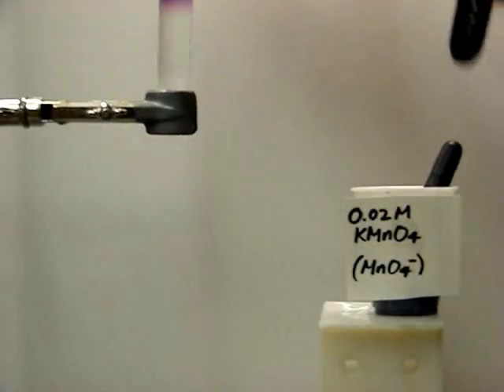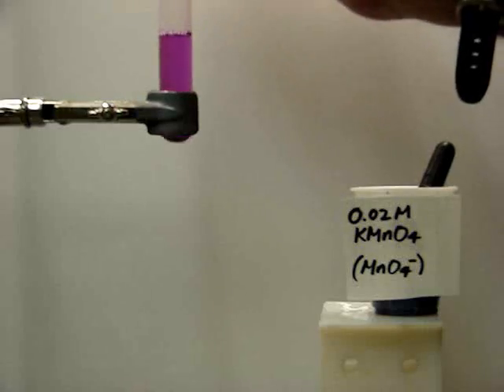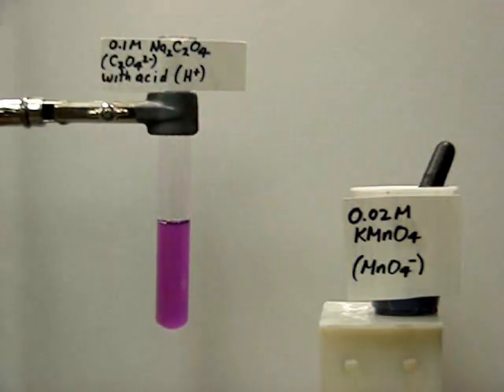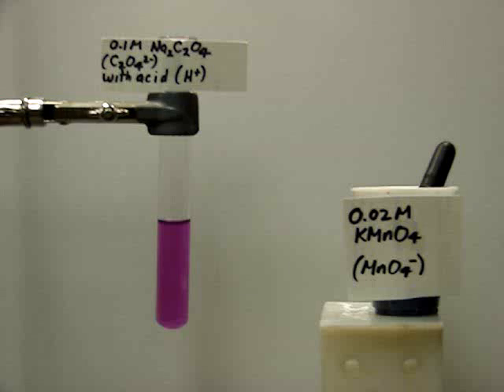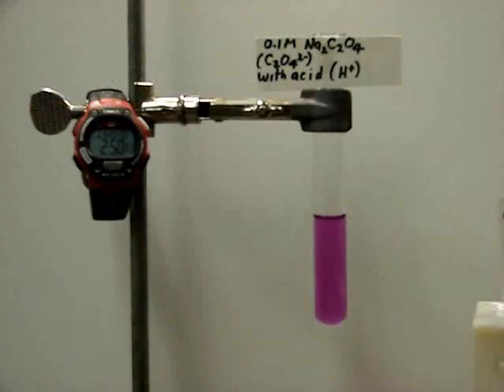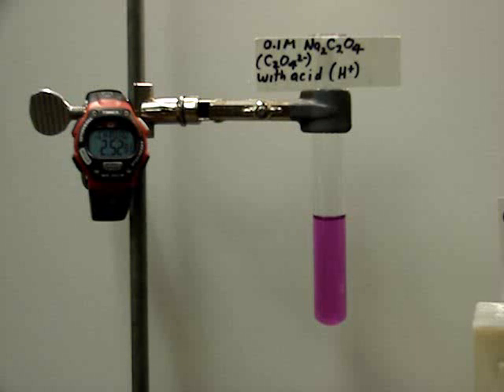Let's give it a shake. And we'll leave it sit for a while, see how long it takes the purple color to disappear. As you can see, about three minutes after we started the timer, the color is still purple.